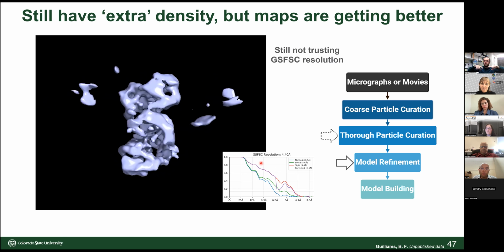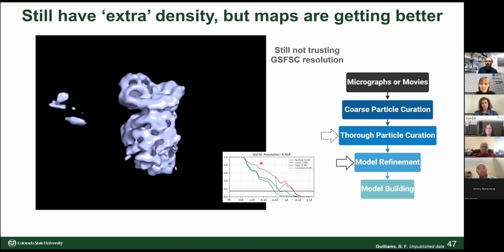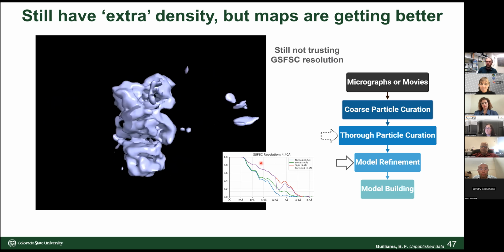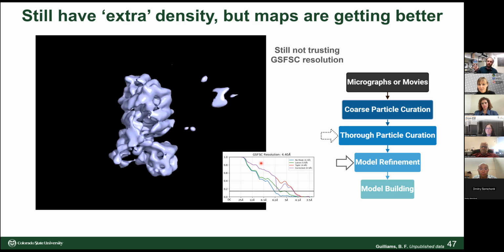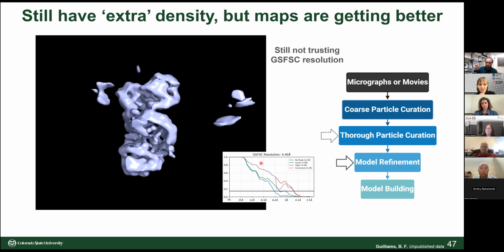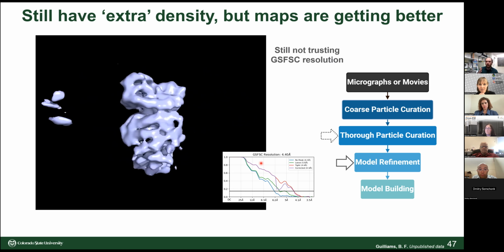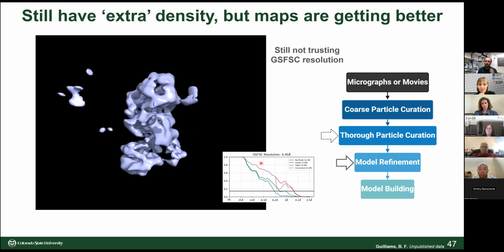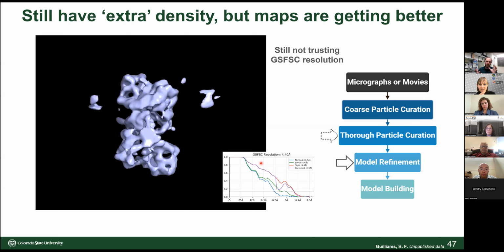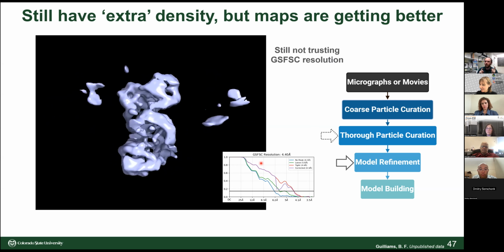We don't see much of a Fresnel fringe in 2D images with selenium nanoparticles inside of cells, something that you might see with a large gold particle. Or we do see that if these selenium nanoparticles grow much, much larger. And some of the work with CLEM imaging, making these bimetallic nanoparticles, some of which are fluorescent, some are not. Like a copper selenide particle is not fluorescent, but because it has this crystallinity, that interacts a bit more strongly. So I've gone on a tangent here, but I'd say not that we've noticed.